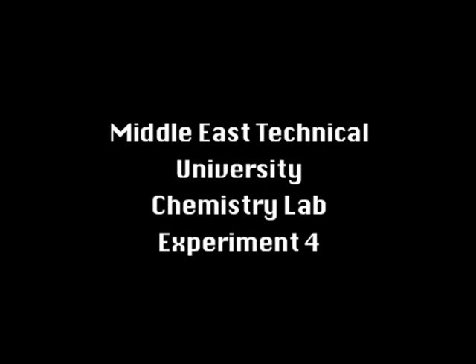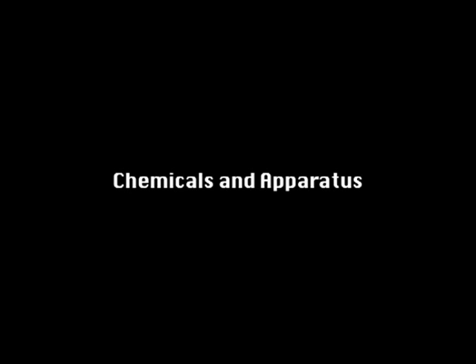Experiment 4: Enthalpy of Formation. Chemicals and Apparatus.